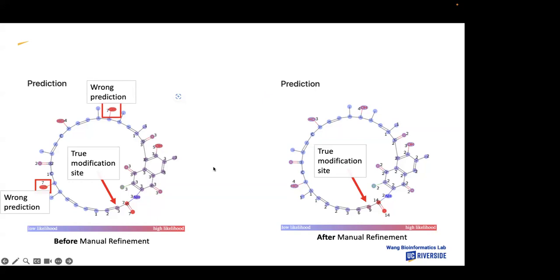We wanted to have this ability for you to refine these annotations based on your knowledge. And once you do that, you can see the true modification site prediction be more accurate. And hopefully this would reduce the time that you would spend annotating all the peaks from scratch yourself and trying to find the intersection of these. All these are now an automated system.